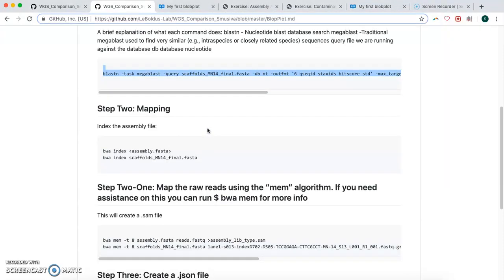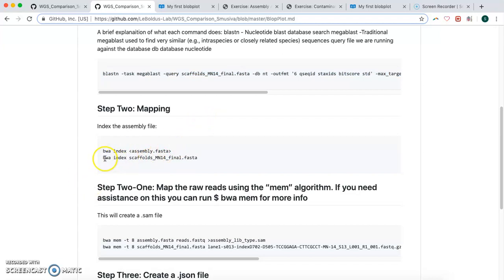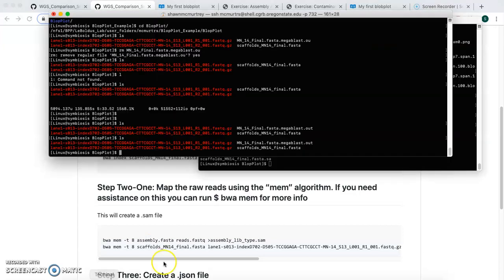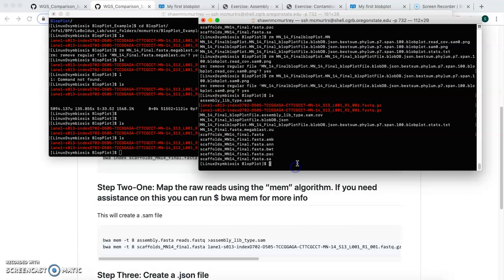Then the second step here is we're going to index our assembly file with the bwa-index.scaffolds. That step doesn't take too long, so we'll run that.